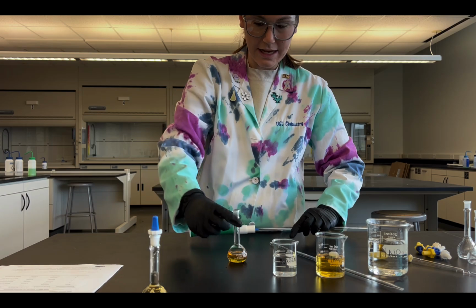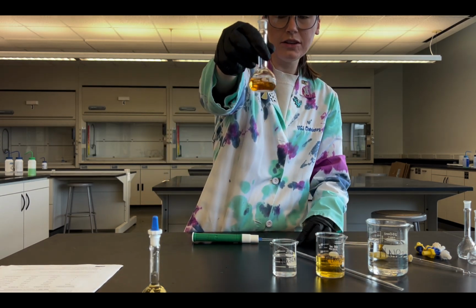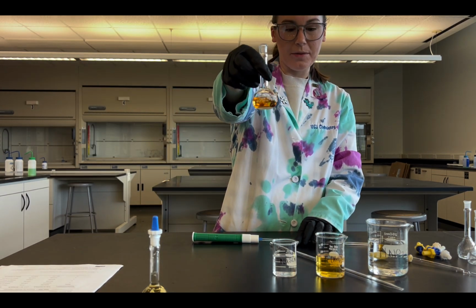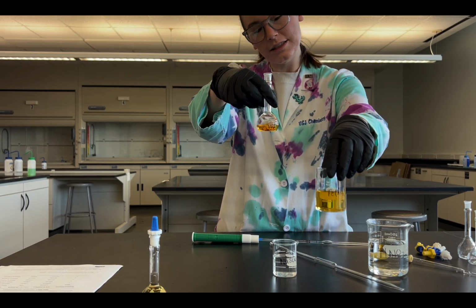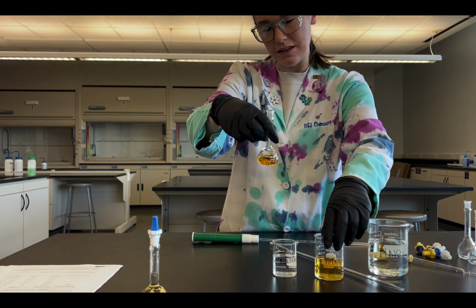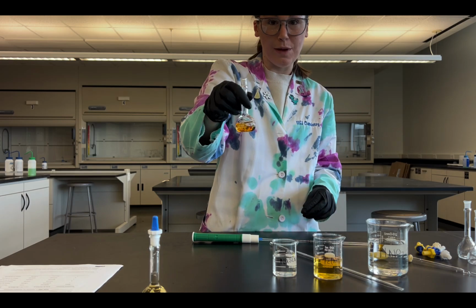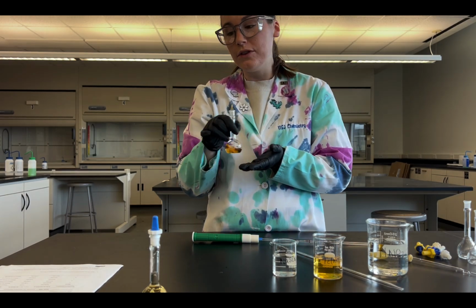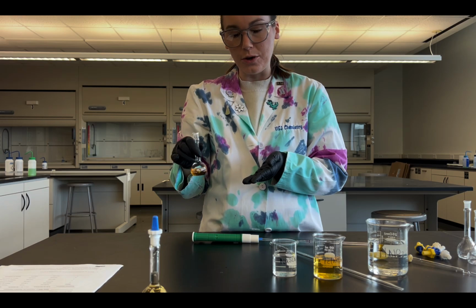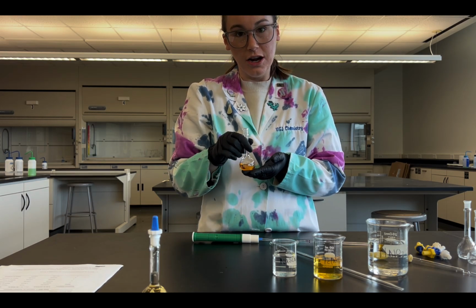So now you can see how my solution got a little bit darker. It went from that yellow color of the iron nitrate to now a more orange color. That's the start of that red solution that the iron thiocyanate is starting to make. This is our lowest concentration solution out of the entire list. So as I get lower and lower, it's gonna get darker and darker, okay?